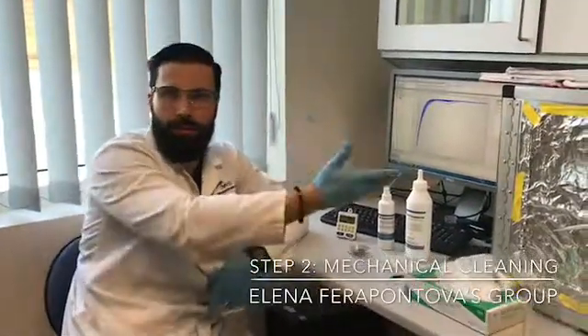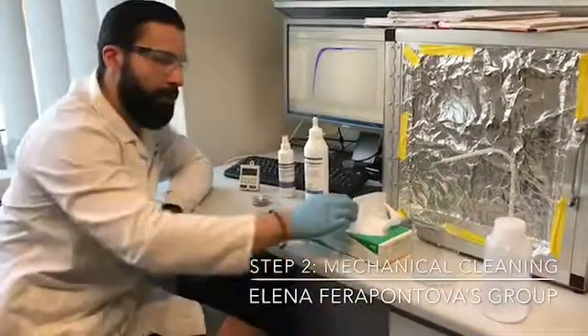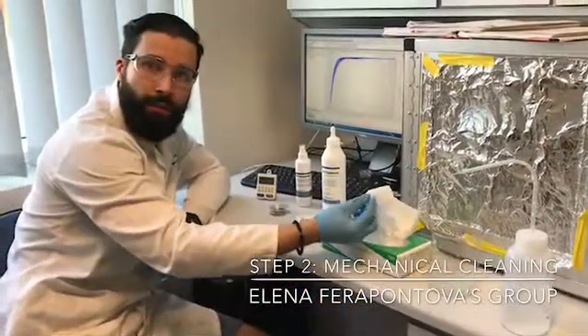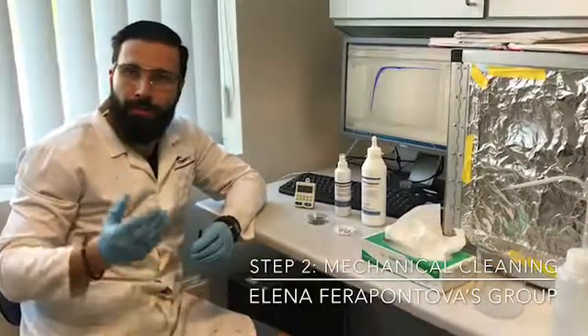In step number two, first we take the electrode from the cleaning, we wash it with DI water, clean it with a kimwipe. Next, we will actually do the mechanical polishing.